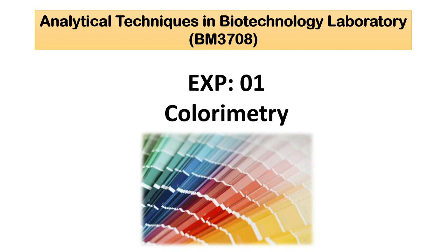Then we'll be doing DSC, which is a thermal analysis. Before that we'll be doing FTIR analysis, which is Fourier transform infrared spectroscopy. After that we'll be doing colorimetry. Then, what did I say before this?